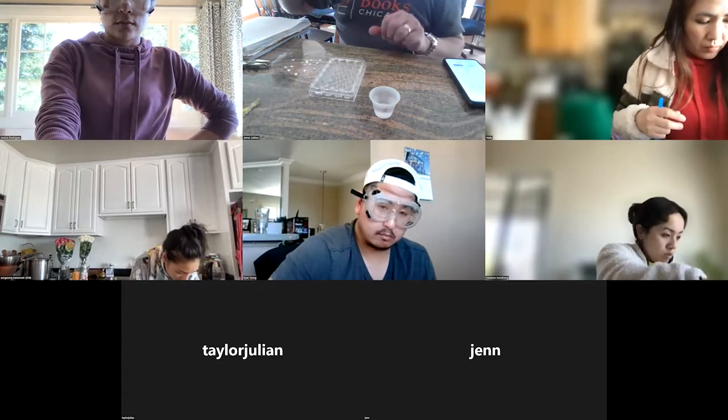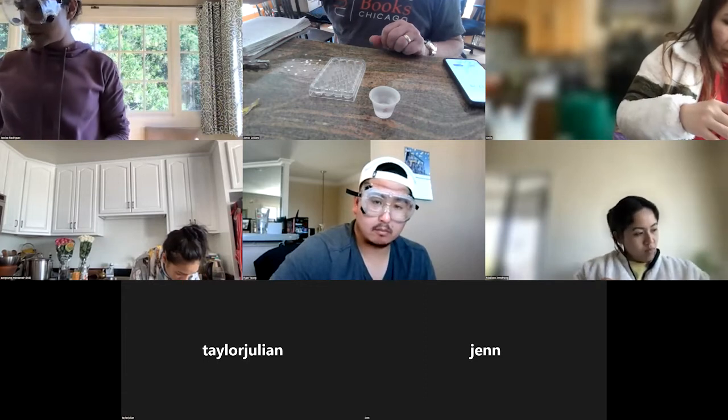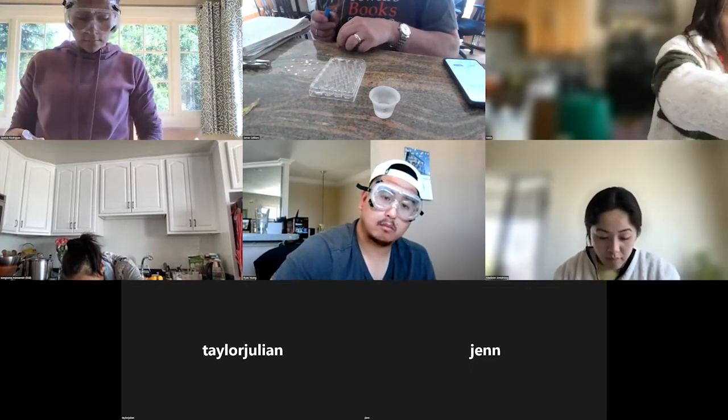I guess everyone's probably going to be a little bit different based on the size of their hole punch. If you have a larger punch, obviously you're going to make larger squares. It's going to take more gas to float them.